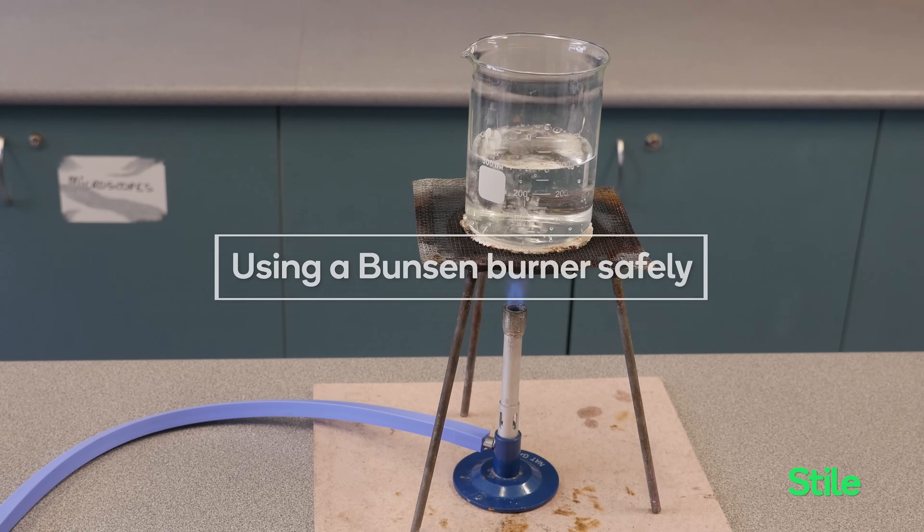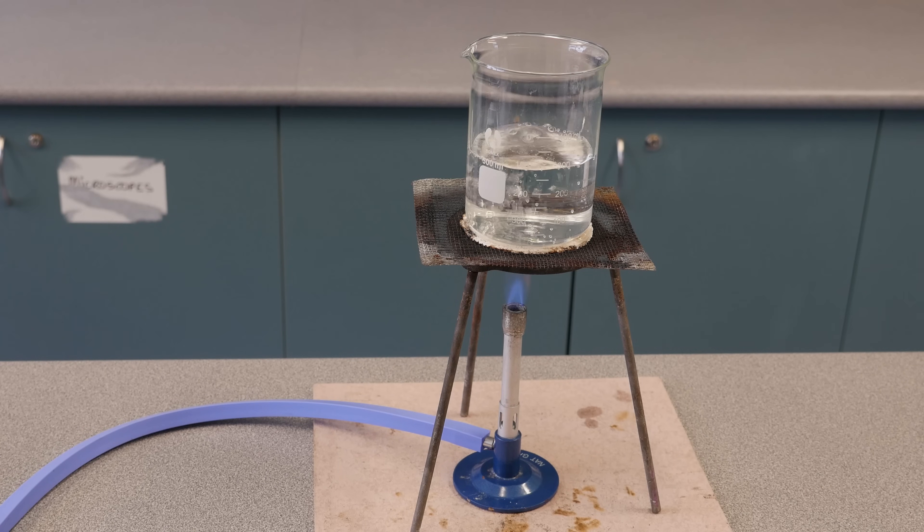The Bunsen burner is a great way of heating up substances in a controlled way, but it must be used with care. A handy way of remembering how to light a Bunsen burner safely is SET ALIGHT. Let's see what this means.